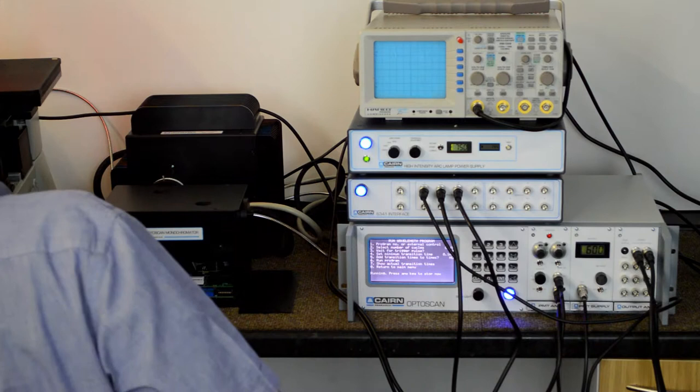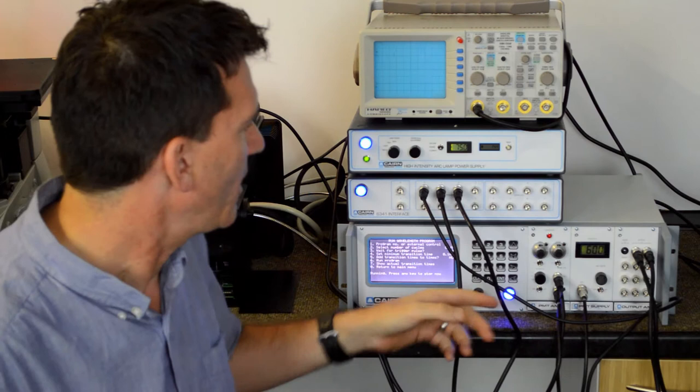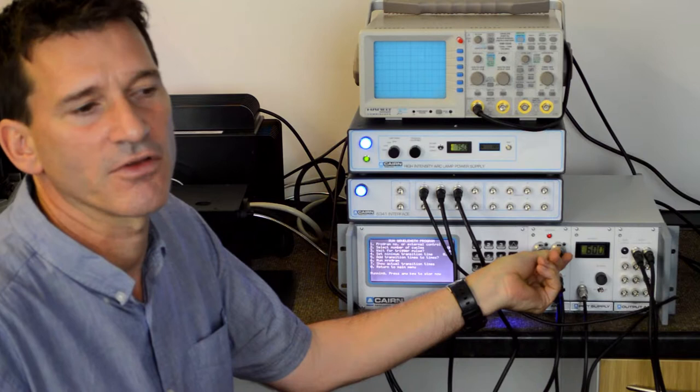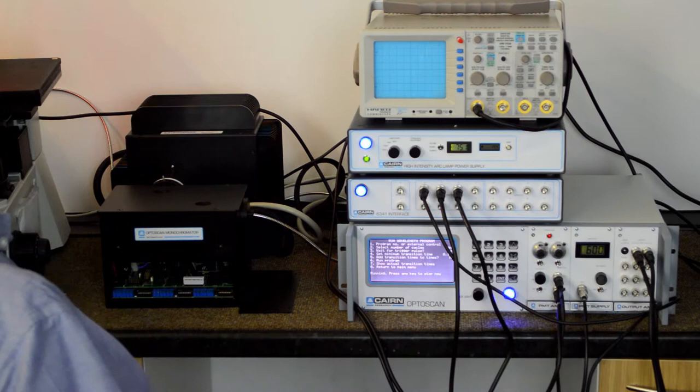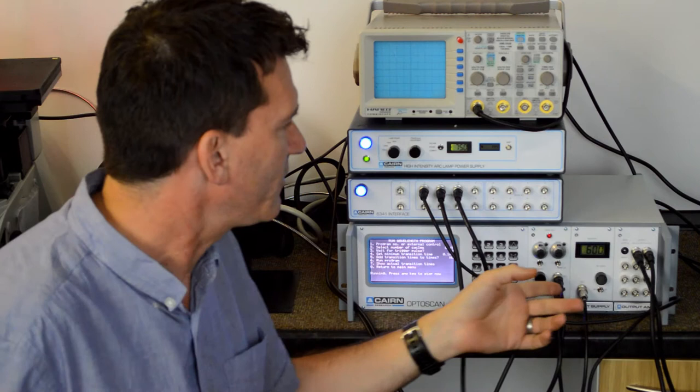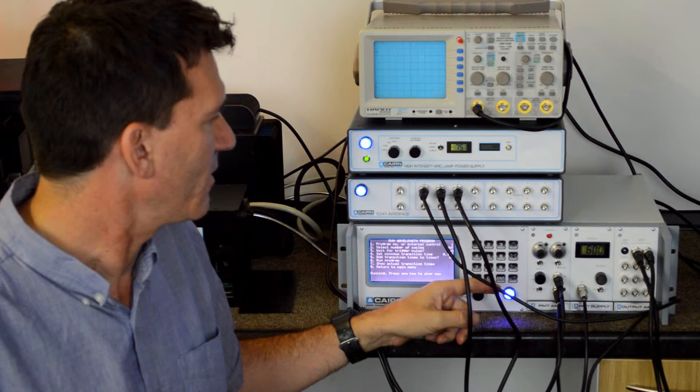And what I can do now is move the sample to an area where there's no cells and introduce some offset to back the signal off to nothing where there's no cells. I then move back to a position where there's cells and you'll see that the signal now does not include the extra component from the background.